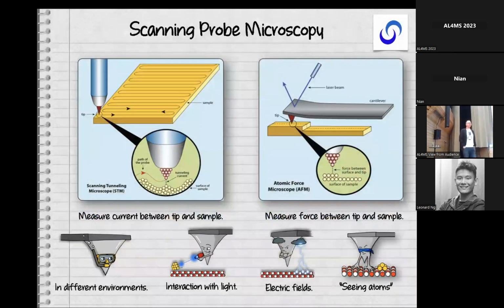So I say scanning probe microscopy, this is a huge field of techniques. You could argue starting perhaps in the early 80s with scanning tunneling microscopy, which we saw a little of yesterday, STM, where you're imaging conducting materials, measuring the tunneling current from a tip. And this has atomic or even beyond orbital resolution of materials if they conduct electrons.